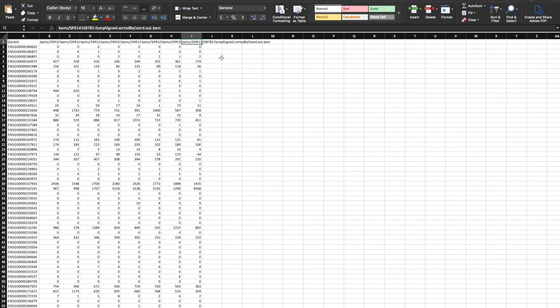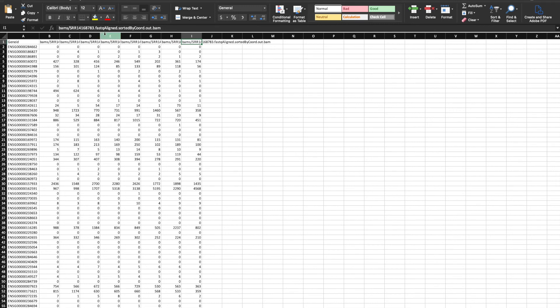So what you're going to want to do is probably rename every one of these columns to match the actual sample name. So it's not this big, ugly, long name.